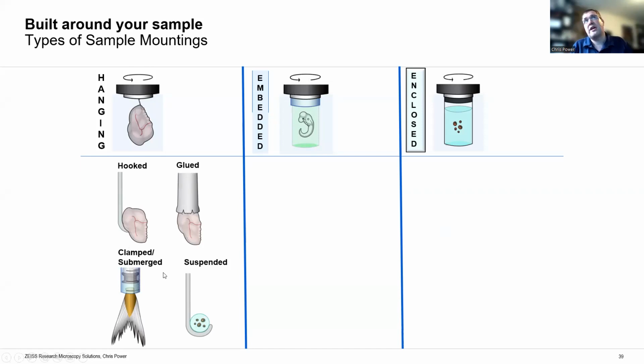In the early days, we were looking at malaria inside mosquitoes, and we did that by putting super glue on one of these poles, letting the mosquito land, get stuck on, and we just put it in the chamber. Now, this technique originally became less popular, but with cleared samples, this became more popular again. So this is still done probably a third of the time, I would say. And this is also probably the most flexible, because it's really the limit of your imagination on how we trap things here.